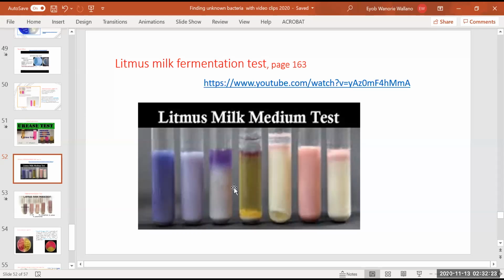You see here now, you are going to find the milk as it is, the natural milk, and then this is alkaline milk, bluish, alkaline at the bottom, and then this is going to have coagulation of proteins inside. Protein is making yogurt.